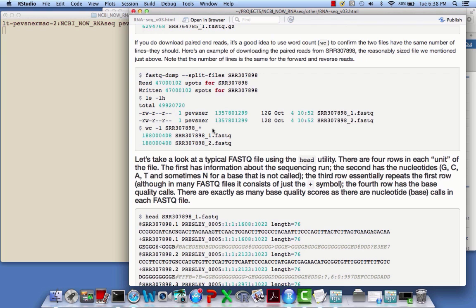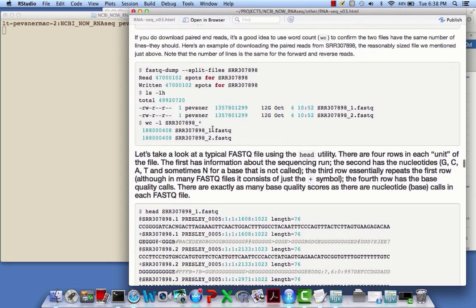And that can be very helpful, for example, to see if they map to an appropriate location. If they map to very distant places, those are discordant reads, and we might be interested in seeing those. But single-end reads are very useful too.